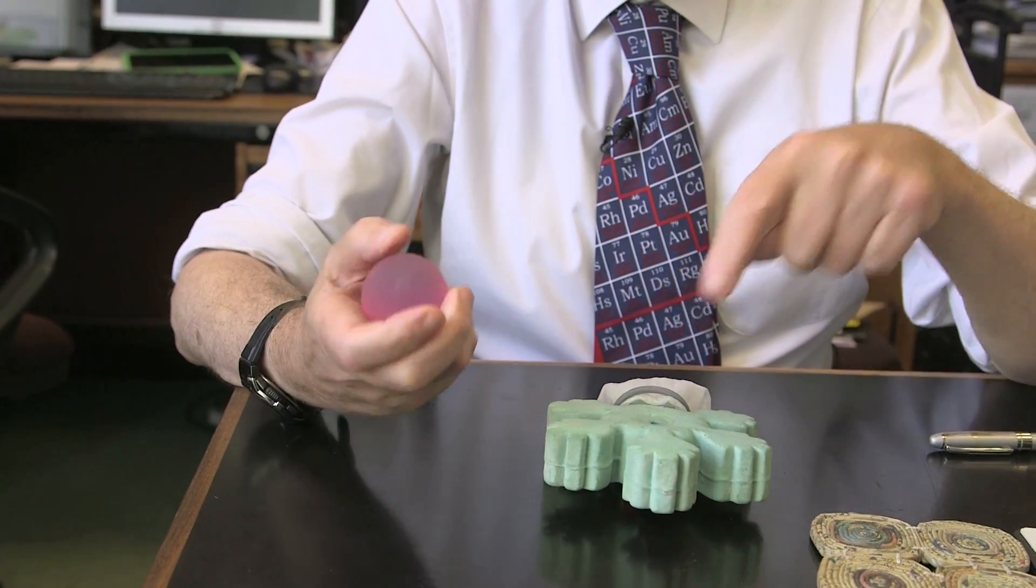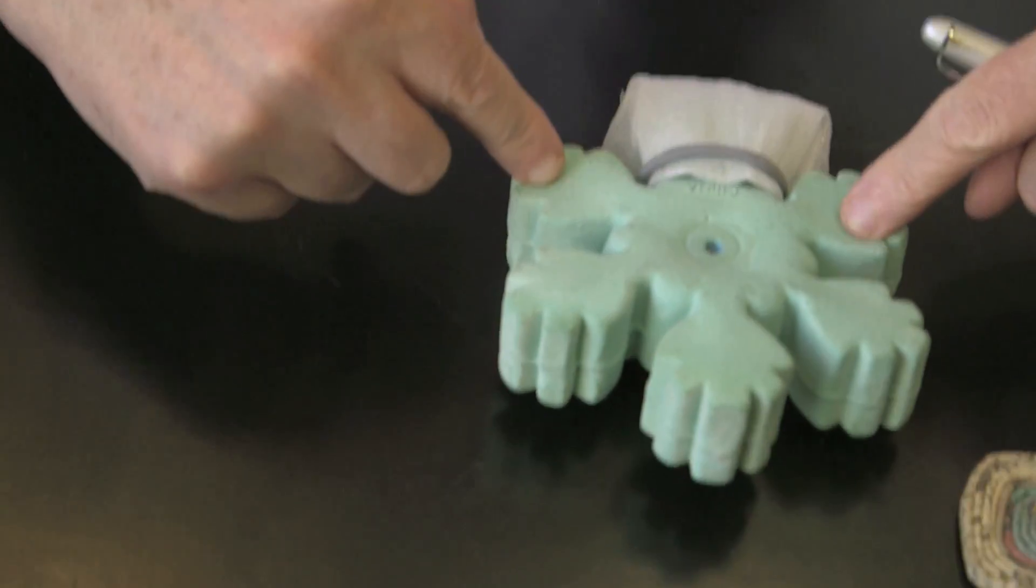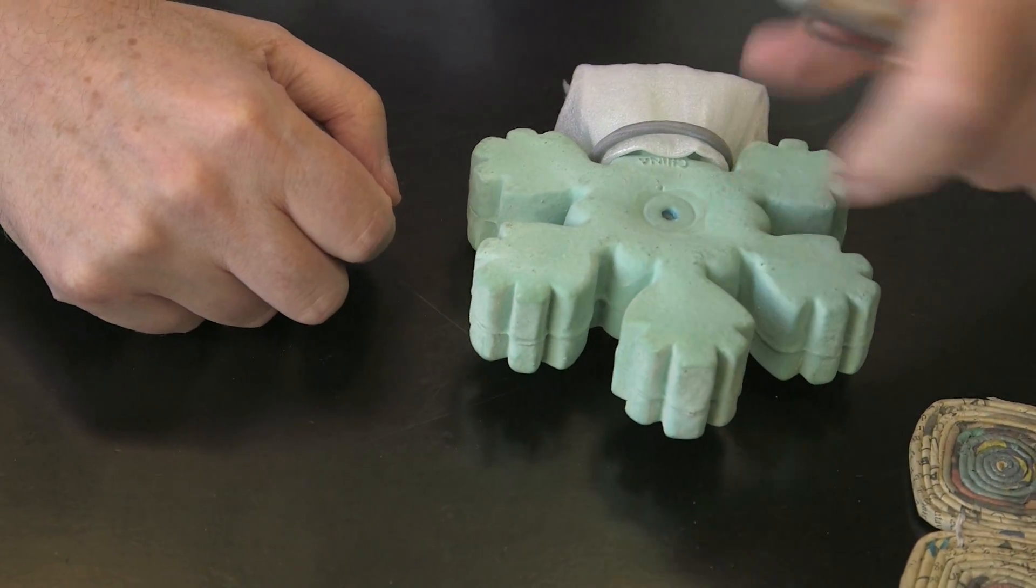But he used this acid, which makes the formaldehyde attack the phenol in this position or that position. These are called the ortho positions or the position here, para.